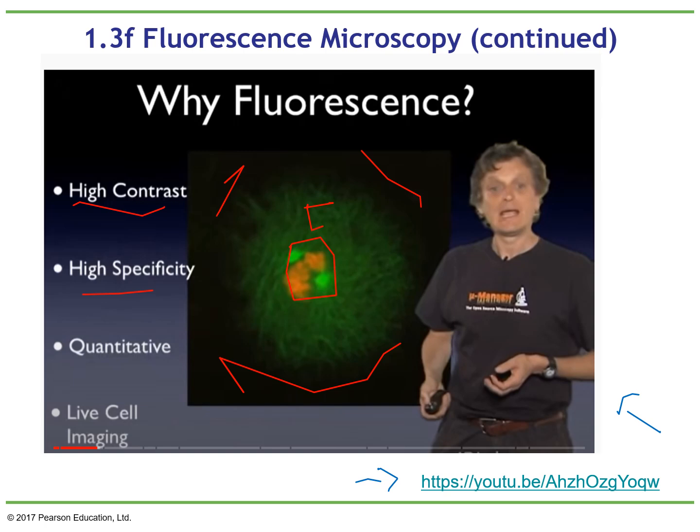So it can allow you to see in more detail what is happening and be sure of what is happening here. One are the microtubules in the cytoplasm. The other ones could be the ones that are going to move the chromosomes. So not only contrast, they also give you specificity. And I'm going to show you in a second why we can have such a high specificity.